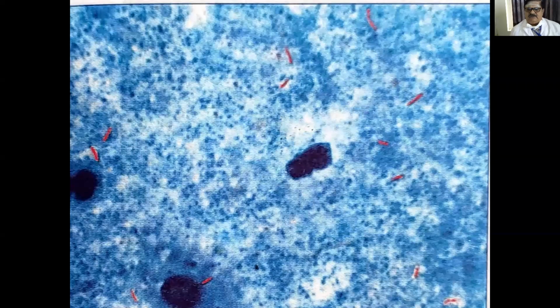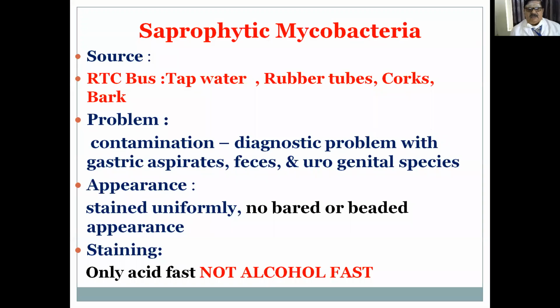Now, want to see more closely? This is how they appear. Blue background. Why is this blue background? That's a question commonly asked. Because you're giving Loeffler's methylene blue as counterstain.